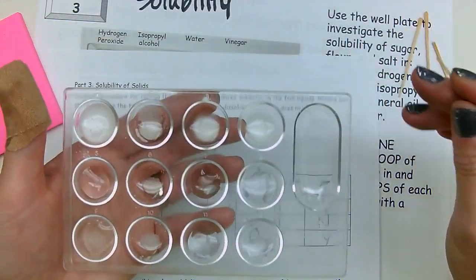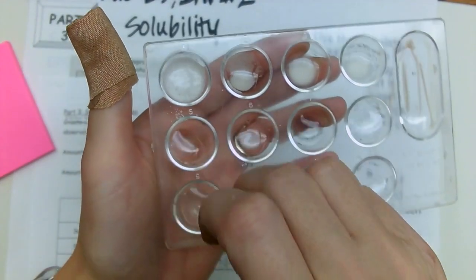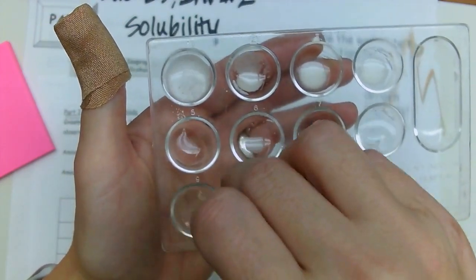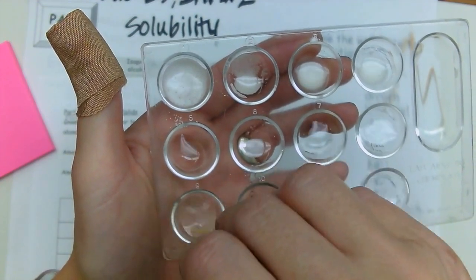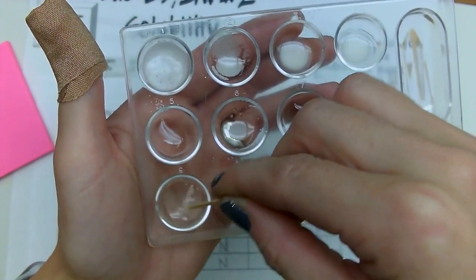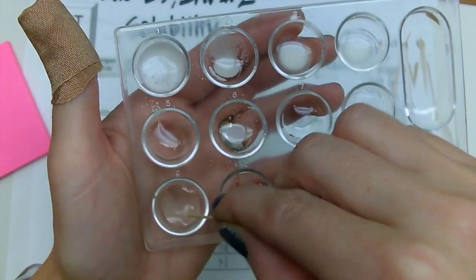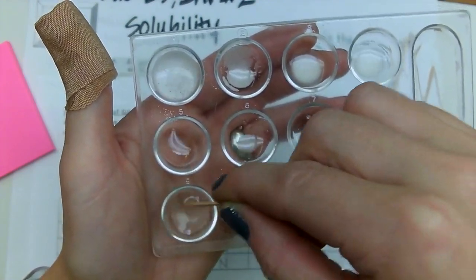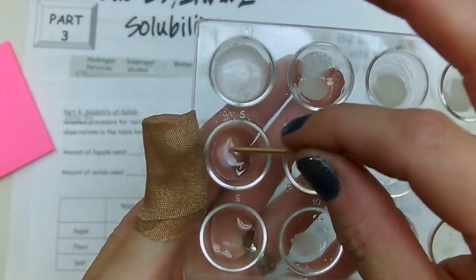This is experimentation. Okay, so up here we have salt, trying to dissolve it in hydrogen peroxide. I see a lot less than I started with. The amount of salt that's left is super small. Seeing it dissolve, okay? And dissolve means it goes away and you can't see it anymore. Oh yeah, that's dissolved in there. Okay, it just looks like a drop of water.